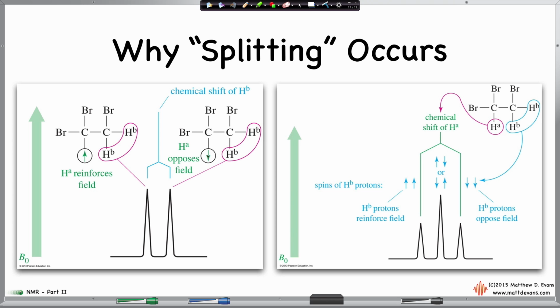This is the neighbor hydrogen right here. This is the signal for these 2 hydrogens, but the neighbor has an influence on the exact resonance frequency for these 2 hydrogens. Okay, so this is called a doublet. It's because these 2 have this neighbor. N+1 says doublet.